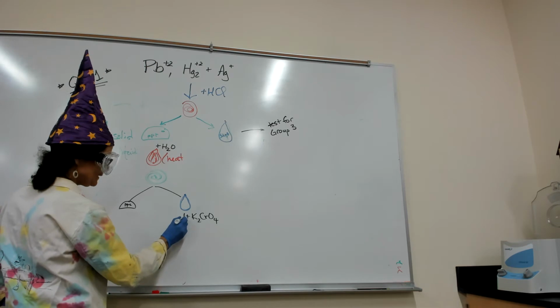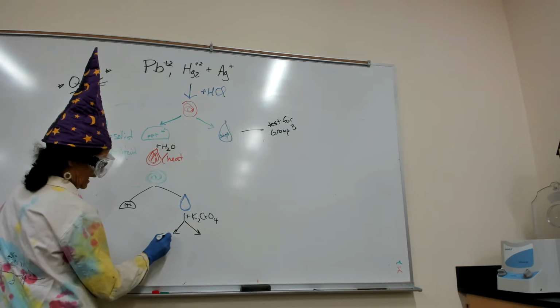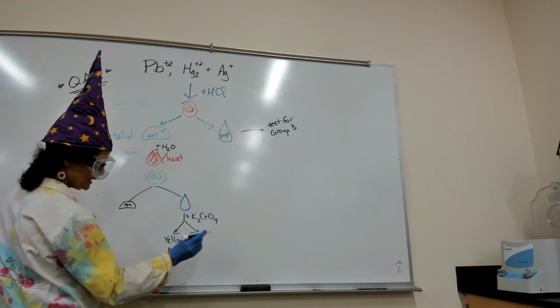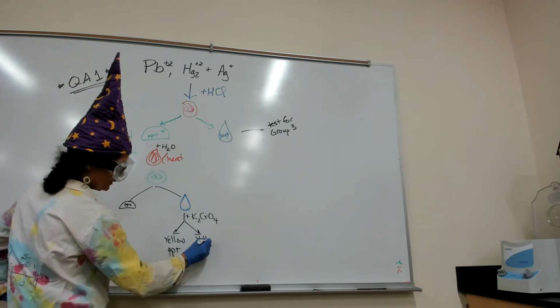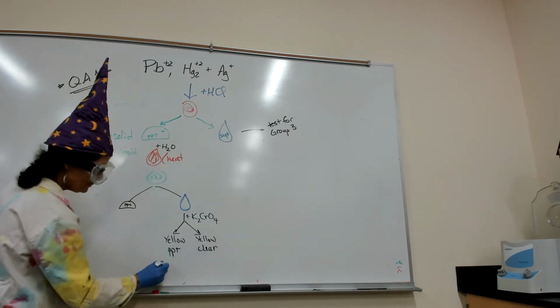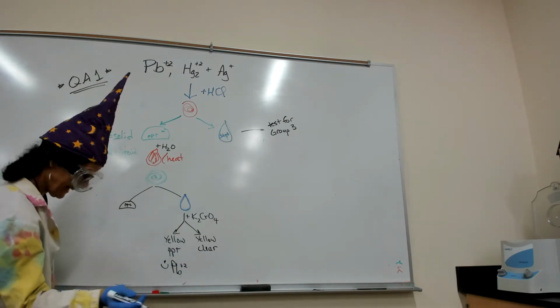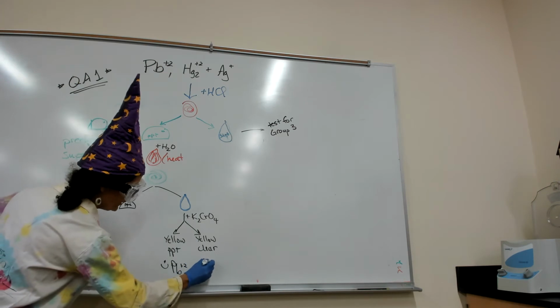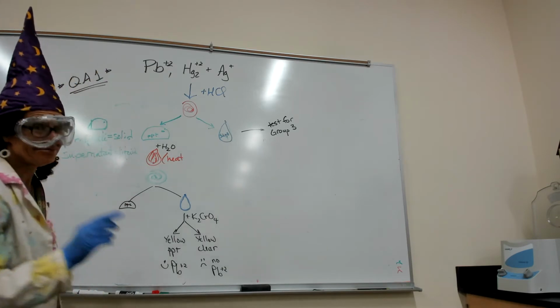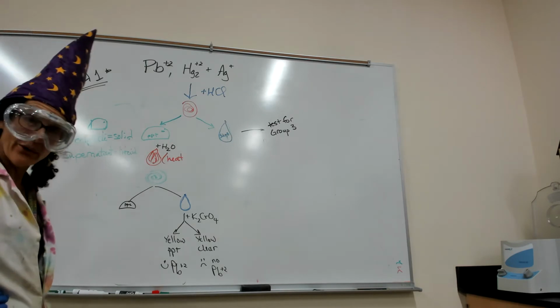And we're going to see one of two things happen. Either we're going to see yellow cloudiness, so I'm going to call it a yellow precipitate, I'm just writing PPT for precipitate, or it's going to be yellow clear. The potassium chromate is yellow. Precipitate means yes, we have lead. This is our test for lead in lab. And no lead, which actually might be a good thing. Poor lead. Misunderstood, but it does cause brain issues. So let's go ahead and try it.